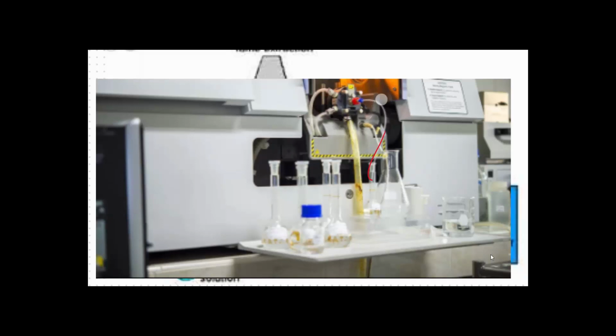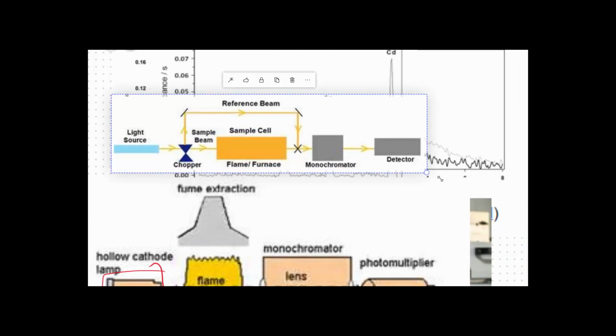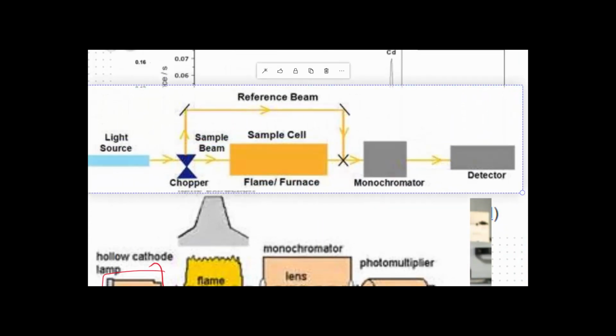Doing my work, I would often set it to take 50 replicate readings because I really wanted to make sure I was getting those degrees of freedom. And it goes quickly. You stick the tube in, you press read, and it does its thing, chunk, chunk, chunk, chunk. Then you put it in the next solution, hit read, and move to the next solution. You never have that tube out in air longer than you need to, which is why you always have deionized water around.